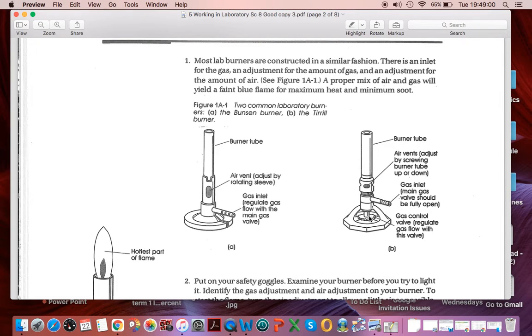At the bottom, you have a base. There's a screw here, and if we unscrew it, that lets more gas in from the gas inlet. So if we want to make a bigger flame, we unscrew that. If we want to make it smaller, we screw it back in.